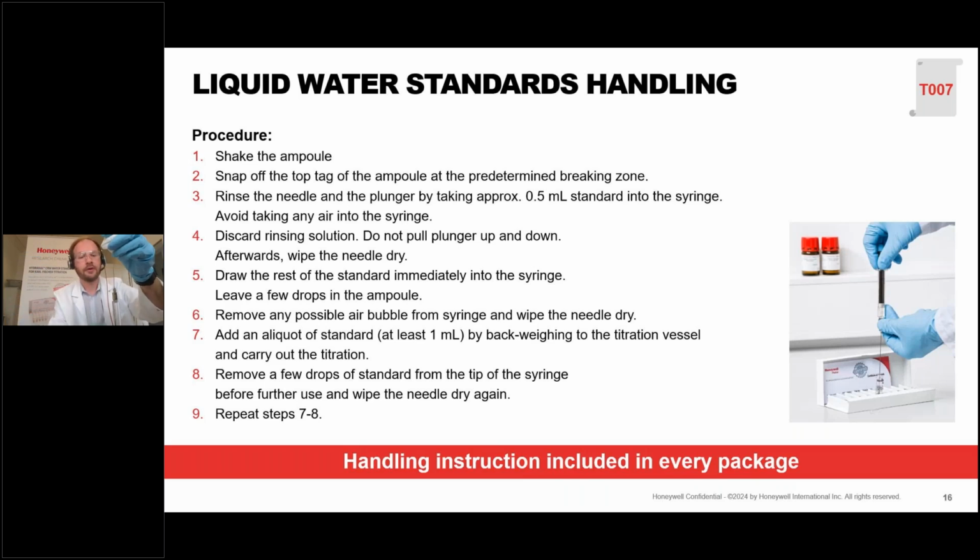And at the last step, you have to remove the bubble and wipe the needle dry, and then the water standard has been transferred perfectly into the syringe, and can then be used for titer determination or validation process. Okay, for this we also have a report that you can download. Good. Let's move forward with the presentation.